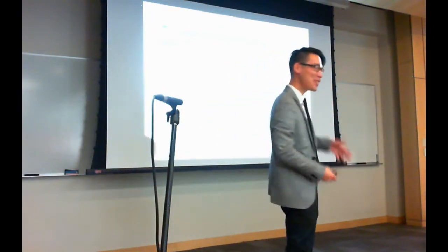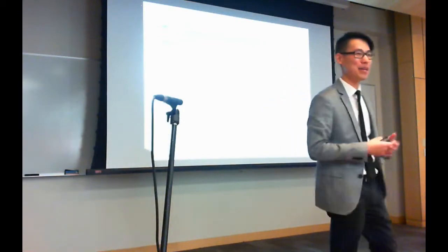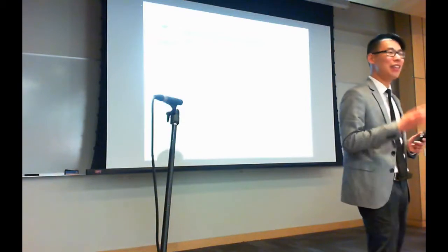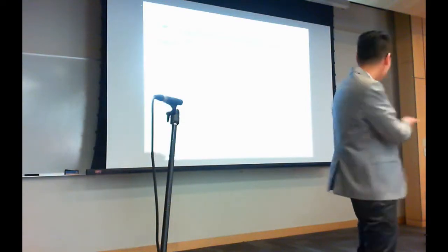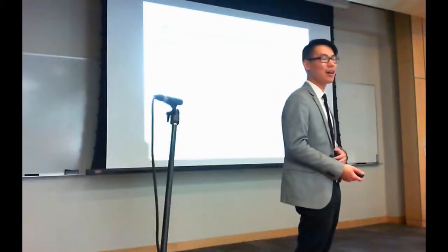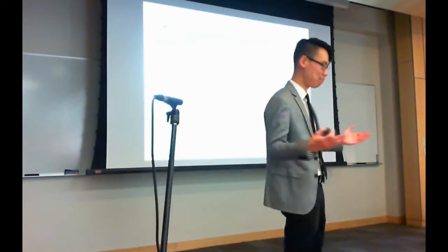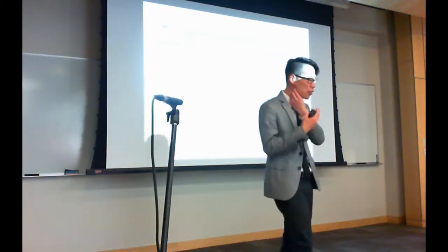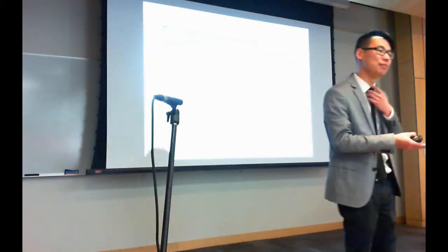We increased the identification rate of these natural product data sets by 3x, from about 0.6% to 2%. That still sucks. 2%, 98% of your data is going to waste. So we implemented some new techniques to try and expand that. And so the thing is, we can only identify 2% of the data exactly.